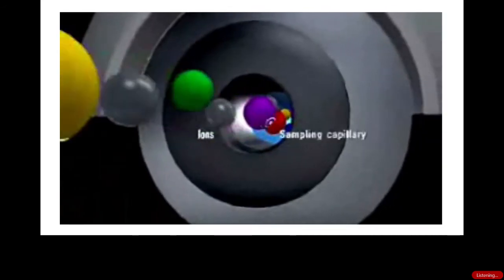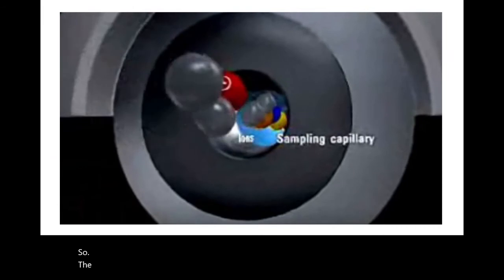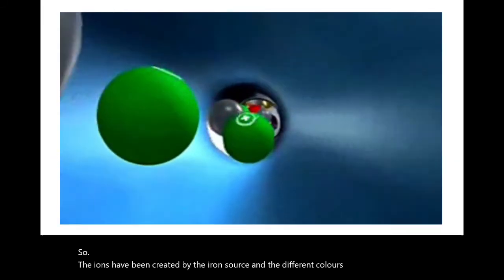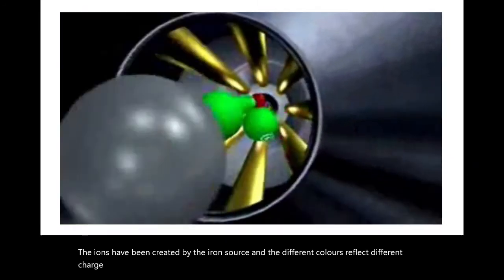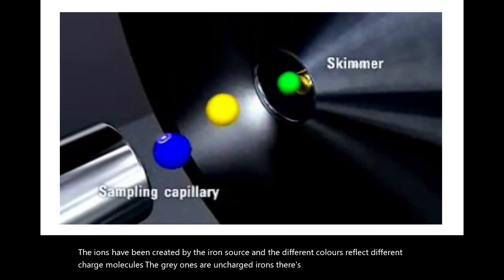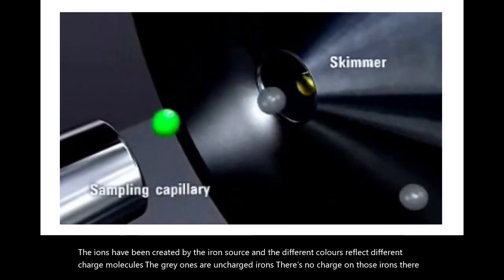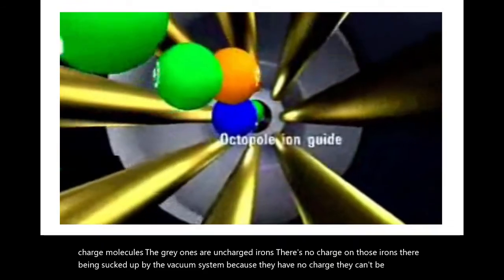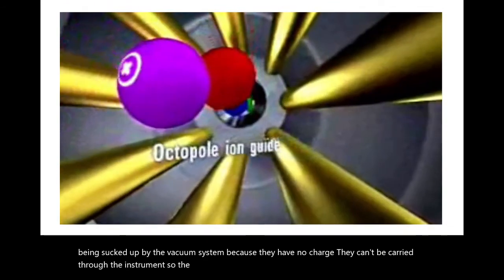So the ions have been created by the ion source, and the different colors reflect different charge molecules. The gray ones are uncharged ions. There's no charge on those ions. They're being sucked out by the vacuum system. Because they have no charge, they can't be carried through the instrument. So the charged ions are now carried through the instrument.